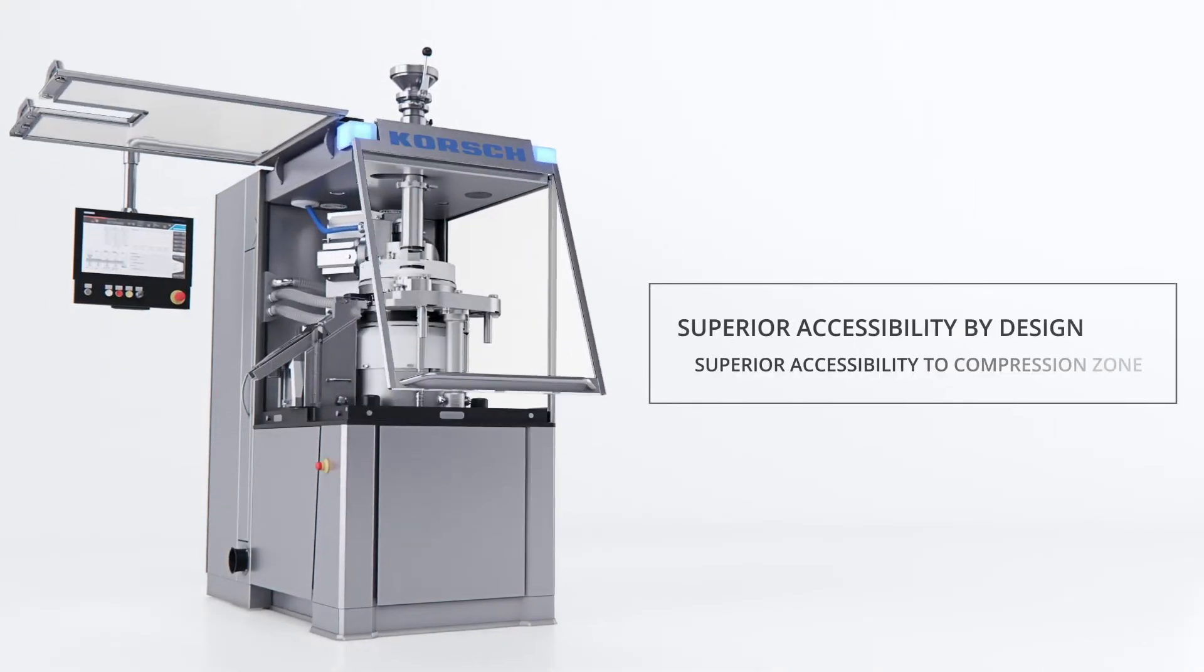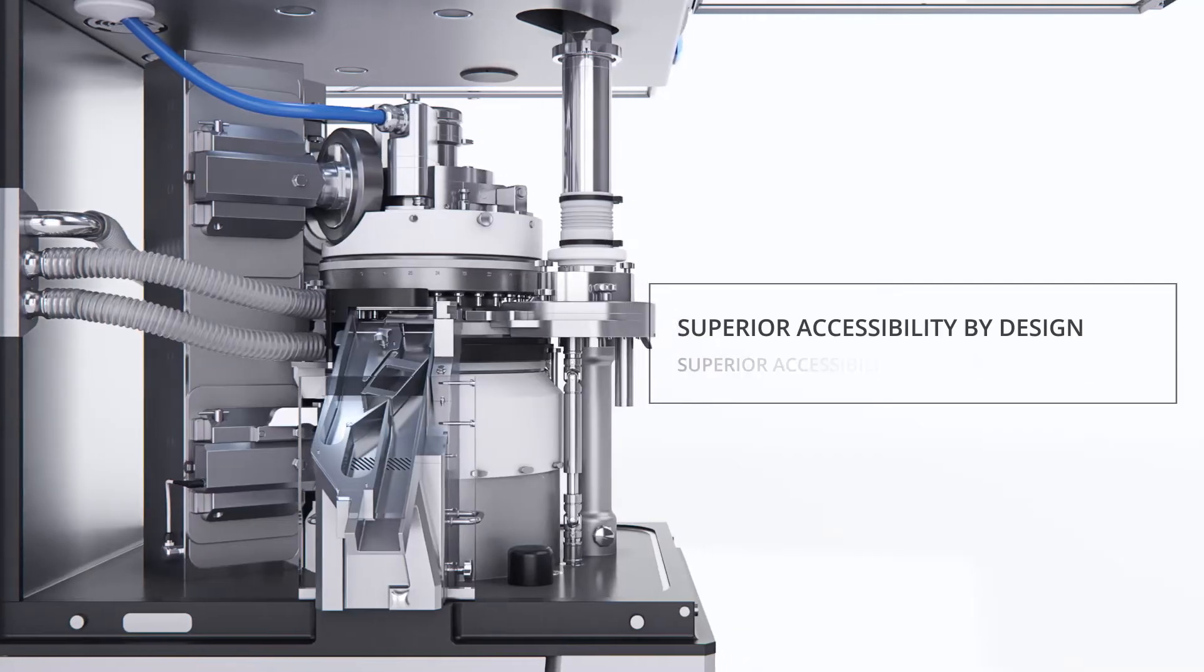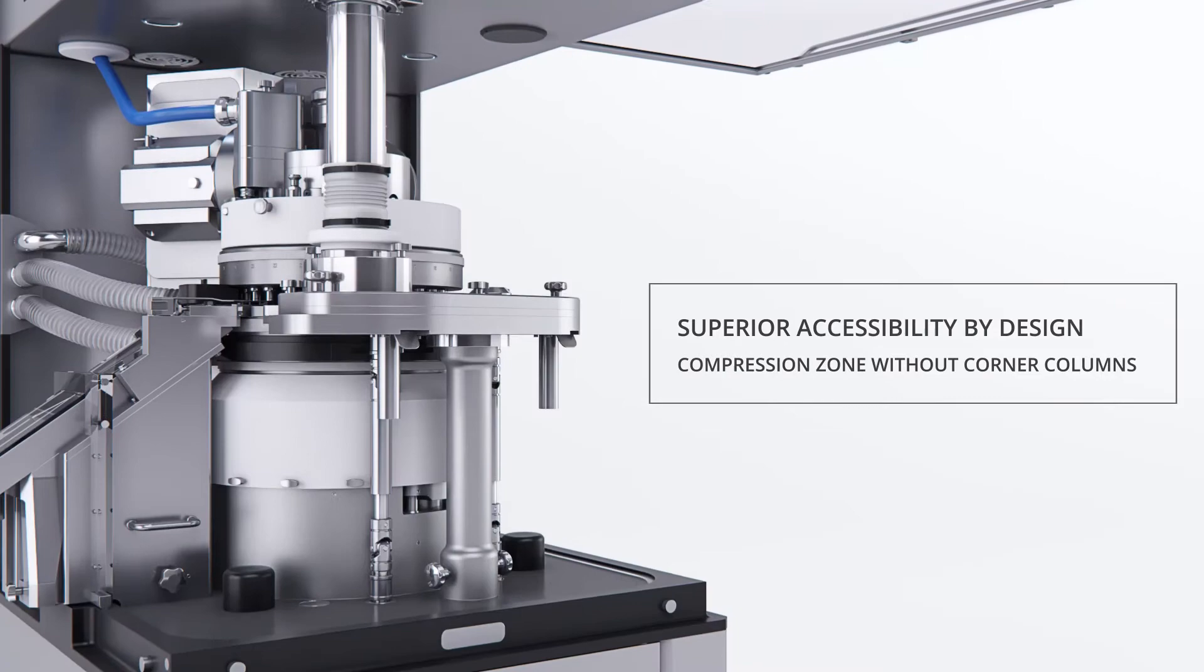The X3 features large windows for excellent visibility and unlimited access to the compression zone to streamline product changeover and turret exchange.